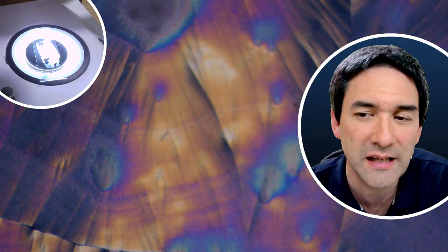Still, the colors do look a little bit dull, so what you can do is, of course, a little bit of contrast enhancement, and then the colors look much nicer. Okay, so I just want to show you now how those colors look when you actually do a little bit of contrast enhancement. Just before the live stream, I took a few pictures and did a little bit of contrast improvement. So I just want to show this to you here.